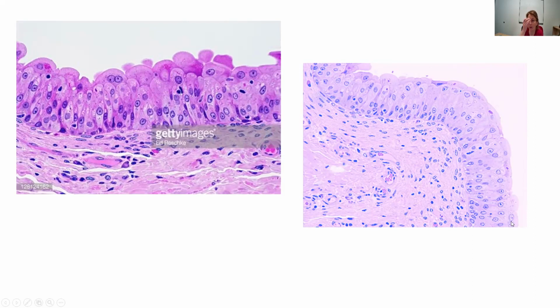Now I can't always see 2 nuclei, but if I can see this where it looks like there's all kinds of layers going on and the cells just don't really seem to fit. I almost want to call them columnar, but then I get all this rounded stuff, and there's like a flattened one. If you look at this image over here on the right, there's like a flattened one here. So I can't go columnar and stratified.